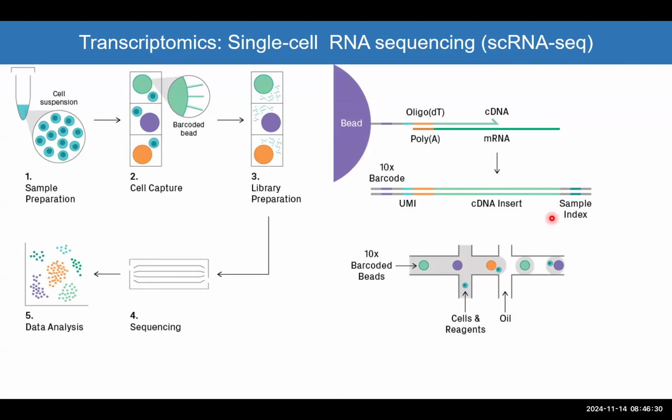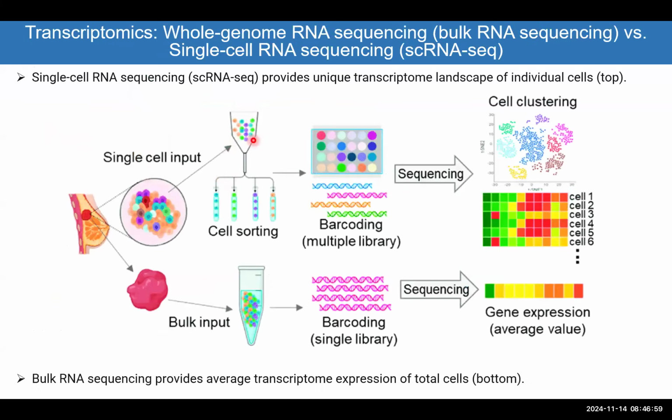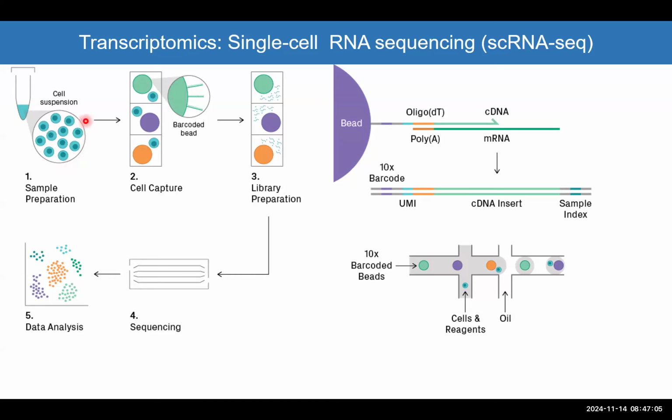So how do we prepare the sample for single cell analysis? First, we have to get the cells dissociated into single cells, and we have to maintain them alive. This is really very difficult because many times when we manipulate tissues, imagine you have the heart and you are dissociating it into single cells. So you have to do digestion steps. Many cells die. And there's also flow cytometry where we have to separate the samples as I showed you here. That is really a very harsh technique on cells too. But then imagine you have succeeded in this and you got the cells in suspension.